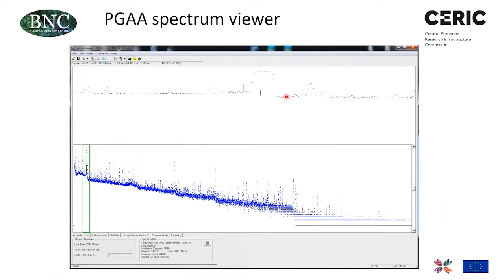And then this Doppler broadening happens, and it makes this boron peak quite wide, about 15 kilo electron volt wide. So this peak shape needs special treatment.